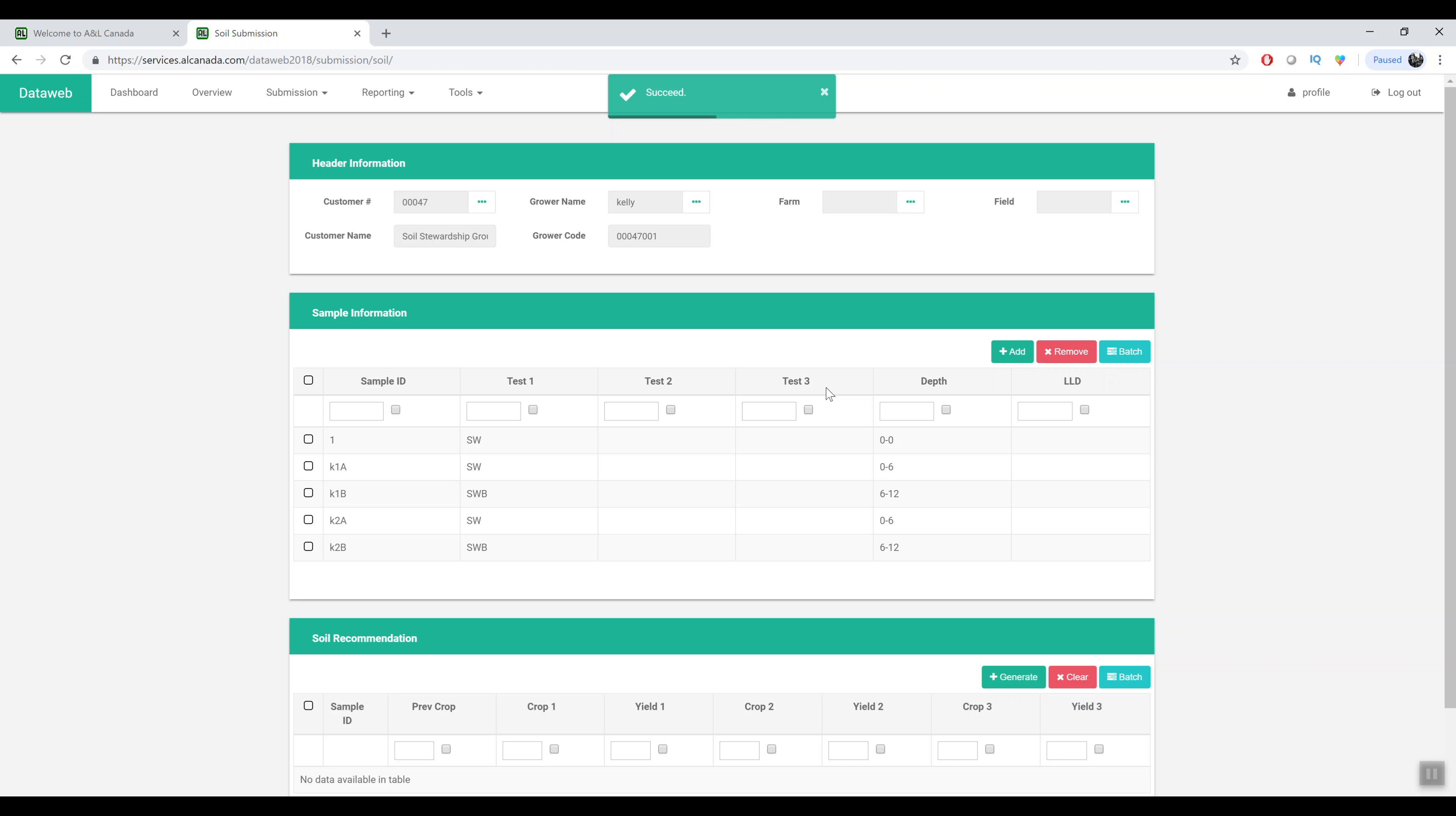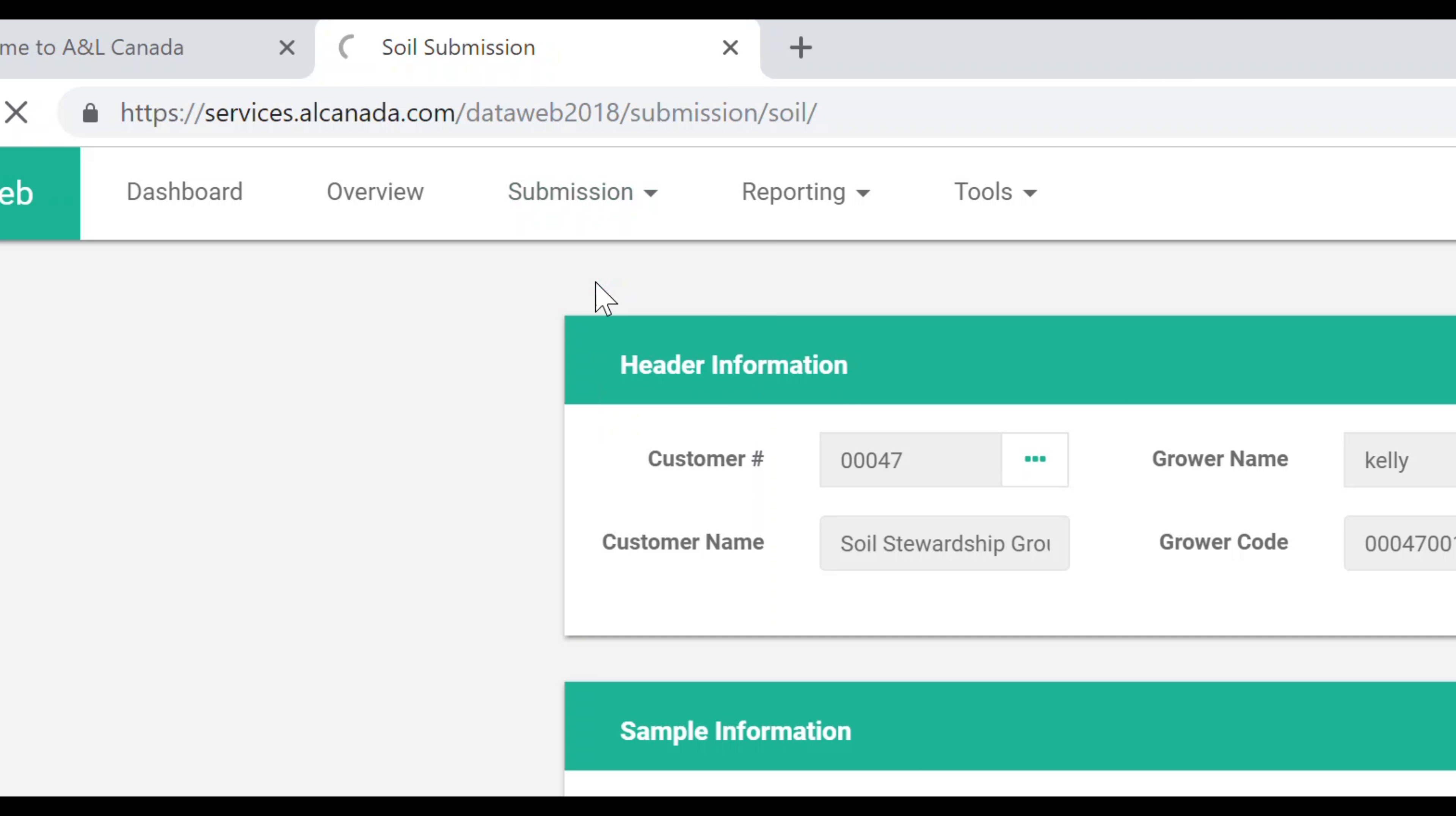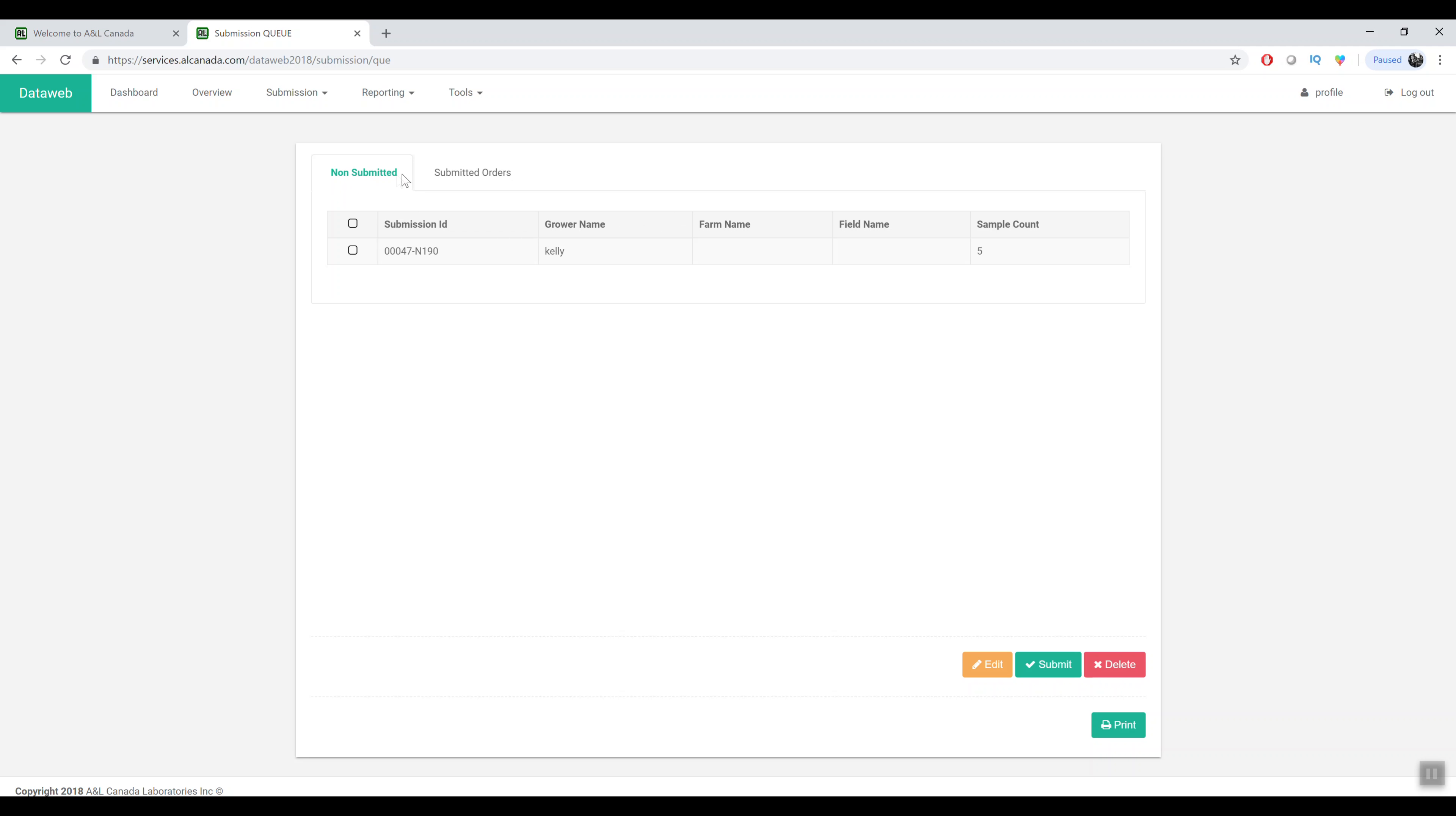In the off season if you want to create numerous submission forms you can come and do all that, add it to your queue, and then when you're actually ready to submit the submissions you can come into here, submission queue, and you'll see a list of all the submissions you've created but they haven't actually been submitted yet. When you're ready to actually submit them you can come in here and submit it and print out your submission form.